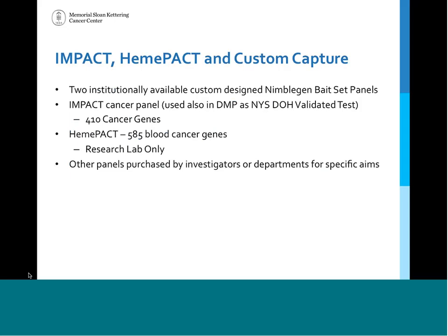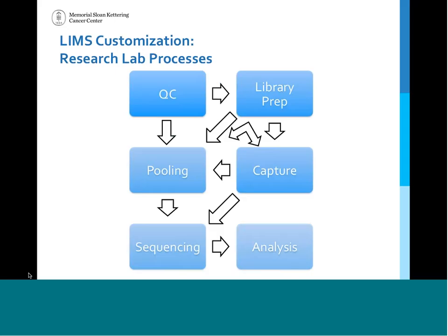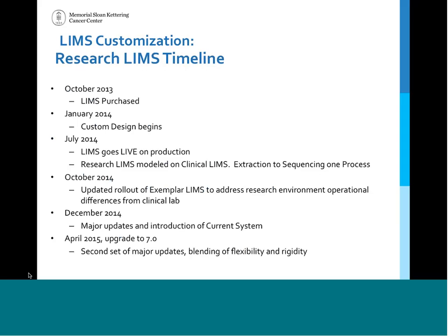So because we have this very similar pathway, we thought that it would be very beneficial if we had a LIMS system that could communicate back and forth and we could share different workflows. But as many of you know, research just isn't always so simple. So in the research lab, we will often go back and forth and really try to push things through even when in a clinical lab they would be failing. So for us, the ability to remain as flexible as possible was a huge hurdle to overcome when it came to customizing our LIMS system.